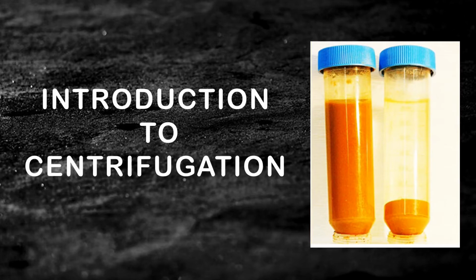Hello everyone. Today we are here to talk about centrifugation. We'll be just giving a brief introduction to the topic, as to what is centrifugation and what can be the differences between sedimentation and centrifugation. What are the basic factors on which centrifugation depends?